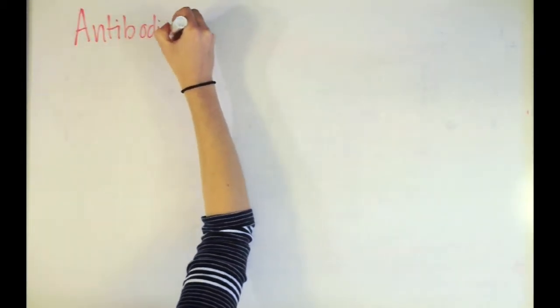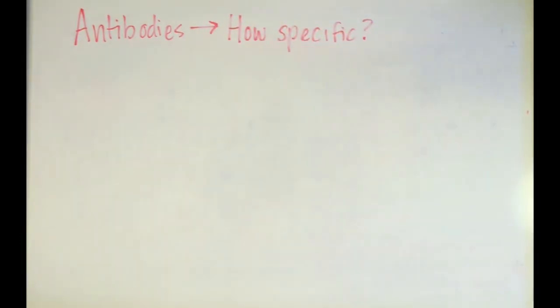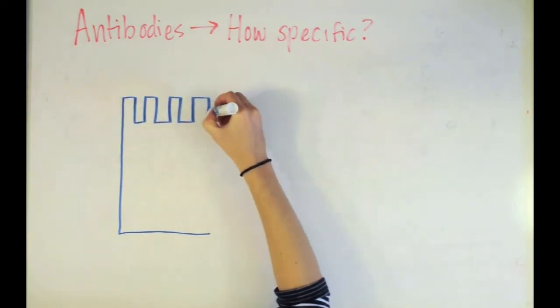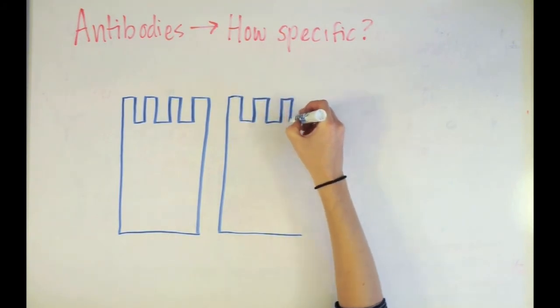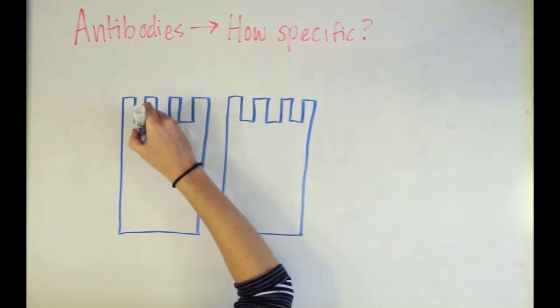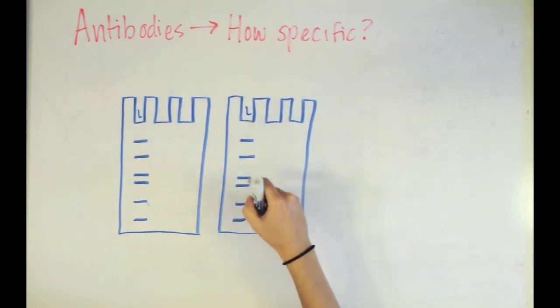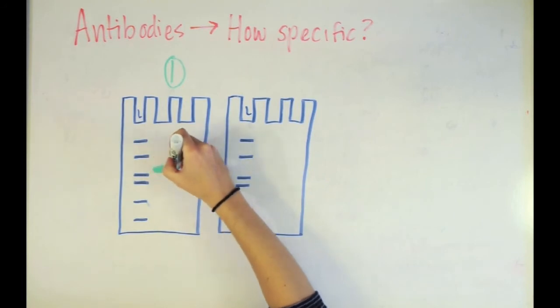Let's take a minute to talk about antibodies, because they can determine if your Western blot works or not. Finding the right antibody can be tricky, but it's vital to a good Western. If there are no good primary antibodies for your protein of interest, there are also other strategies that can be used to measure the level of protein expression indirectly. The yeast lab uses one of these, but I won't get into the details here.